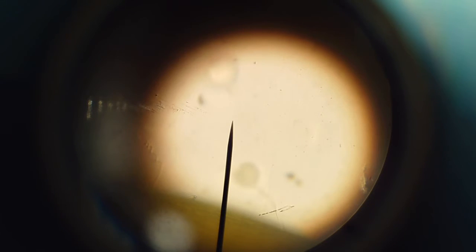All right, these are vorticella. See if I can get them to tune in just a smidge. There's a guy, nice. You can see their stalks nicely, they spiral up.